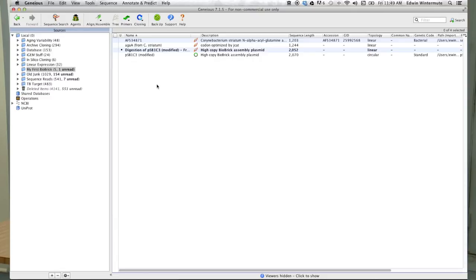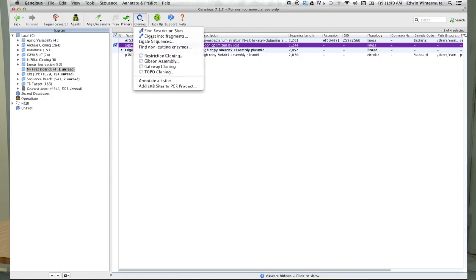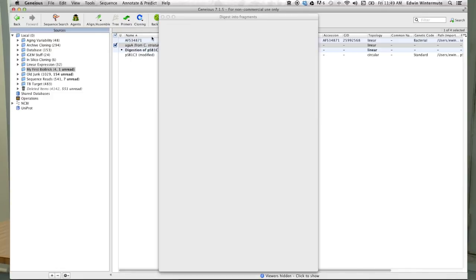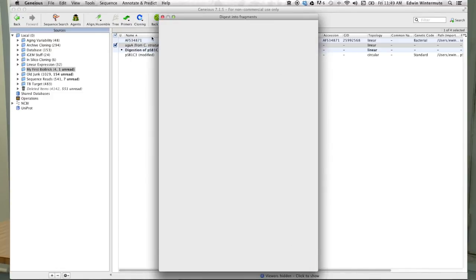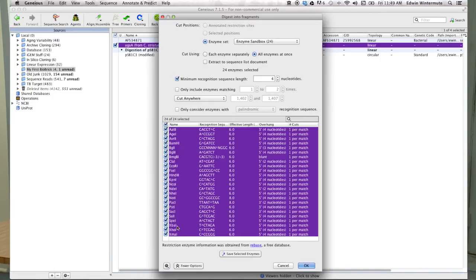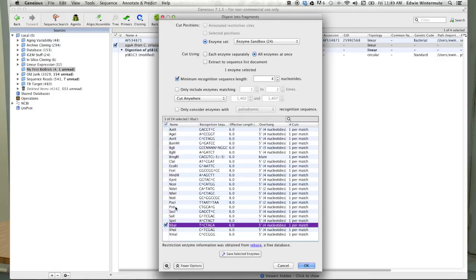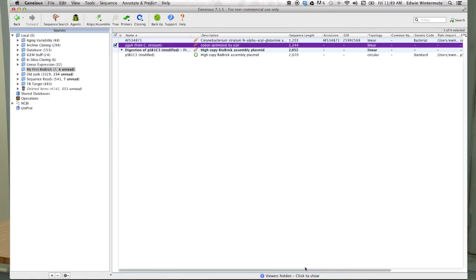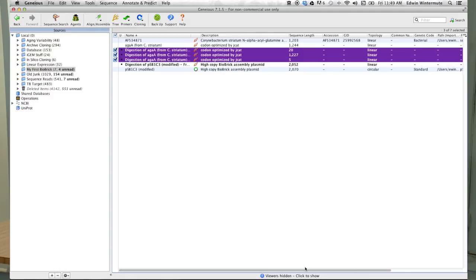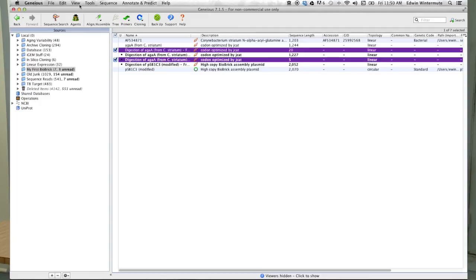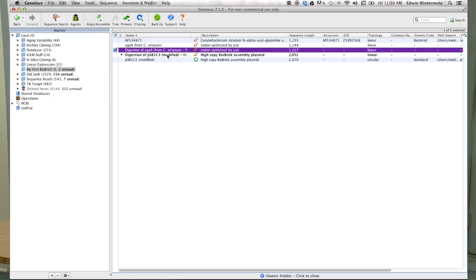And then I will similarly digest our new construct, our AGA enzyme coding sequence, with XbaI and PstI. Alright, looks good. And just like before, I'm going to go ahead and delete these small DNA fragments - we're not going to use those.